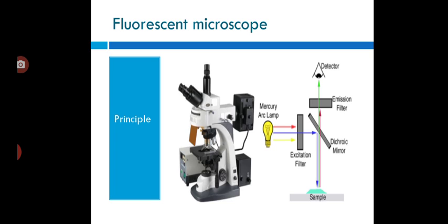Fluorescent dyes, also known as fluorophores or fluorochromes, are molecules that absorb excitation light at a given wavelength, generally UV, and after a short delay emit light of a longer wavelength. The delay between absorption and emission is negligible, generally on the order of nanoseconds. The emission light can then be filtered from the excitation light to reveal the location of the fluorophores.